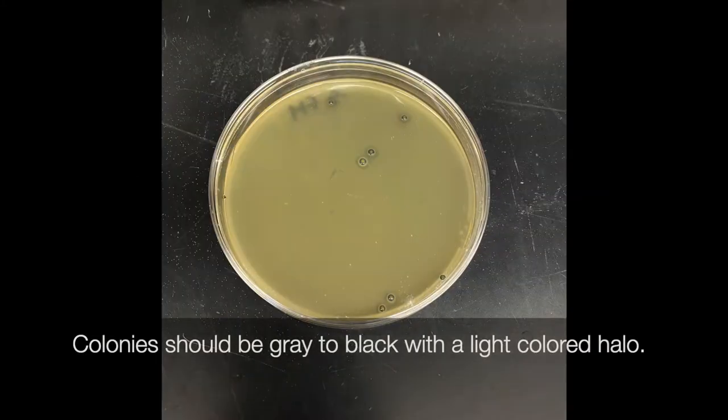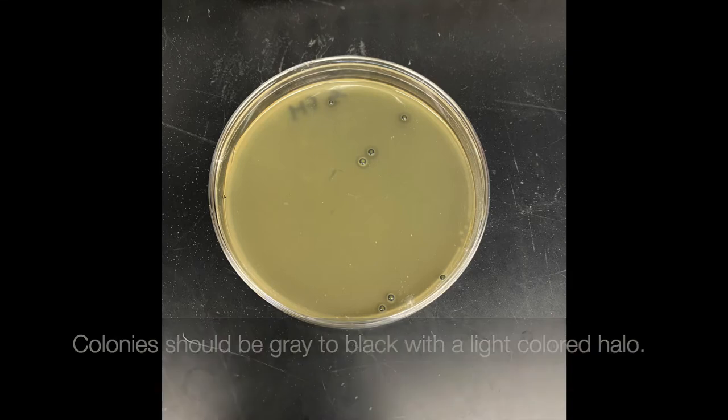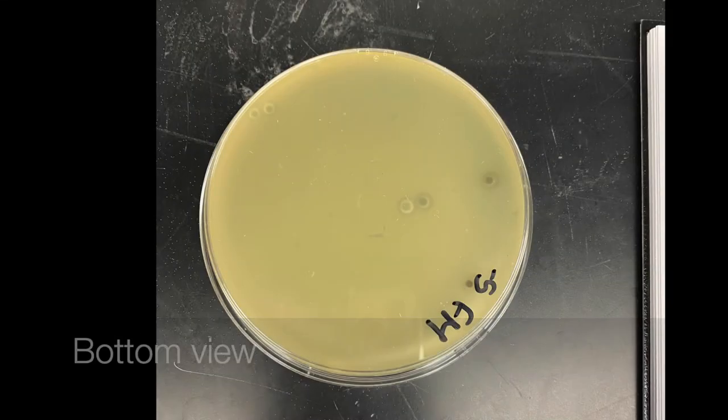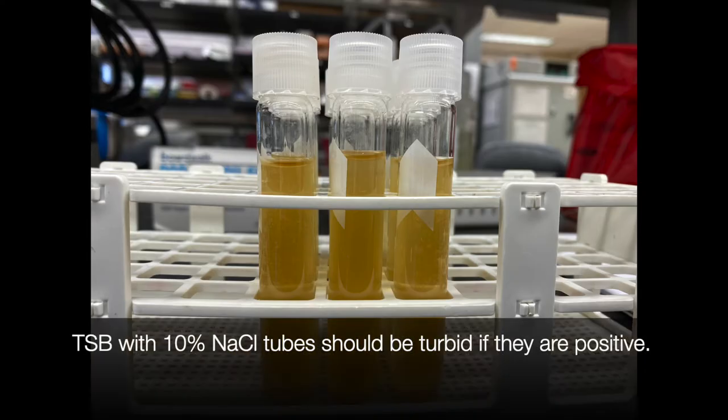Step 6 is to check and record your results. Colonies should be gray to black with a light colored halo. Here's just another bottom view of the plate. Count the colonies and then add all four plates up from the same dilution to get your results for that dilution. Also check your MPN tubes — the TSB with 10% salt tubes should be turbid if they are positive.